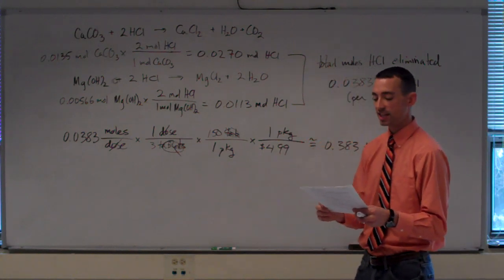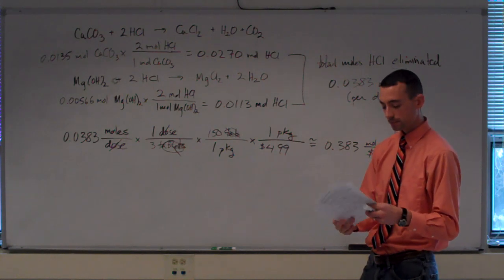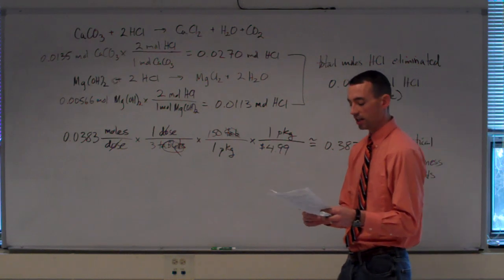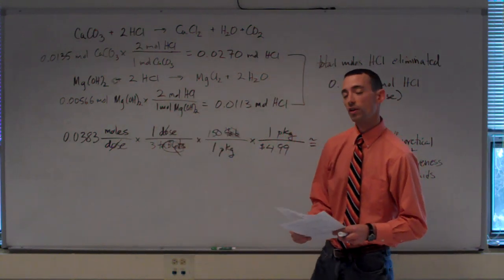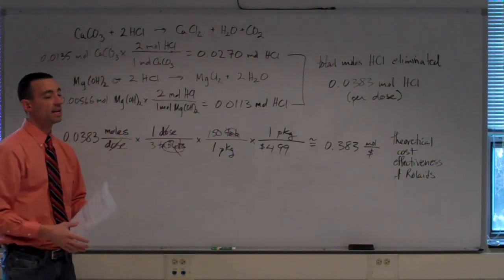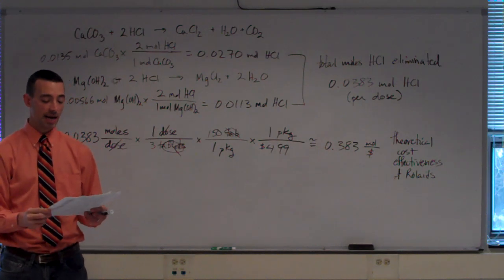So they should have the same theoretical neutralizing capacities, unless their dosages are different. And then lastly, milk of magnesia contains only the magnesium hydroxide. So you've really seen all of the reactions, except for the aluminum hydroxide reaction, that you'll need to calculate those theoretical neutralizing capacities.